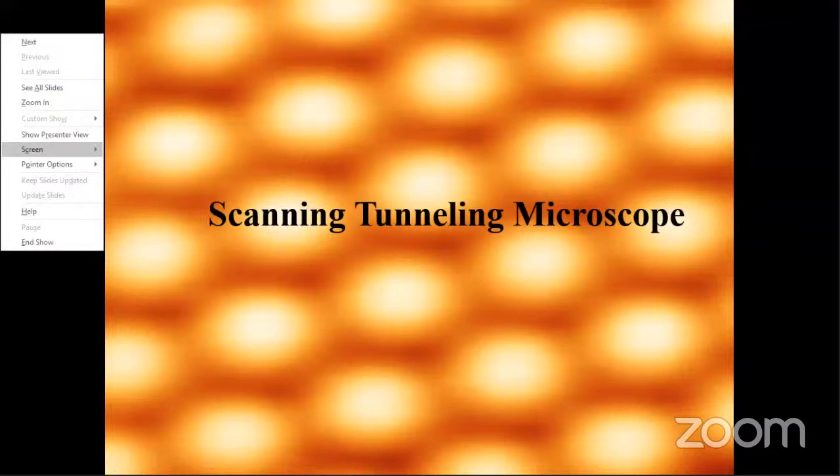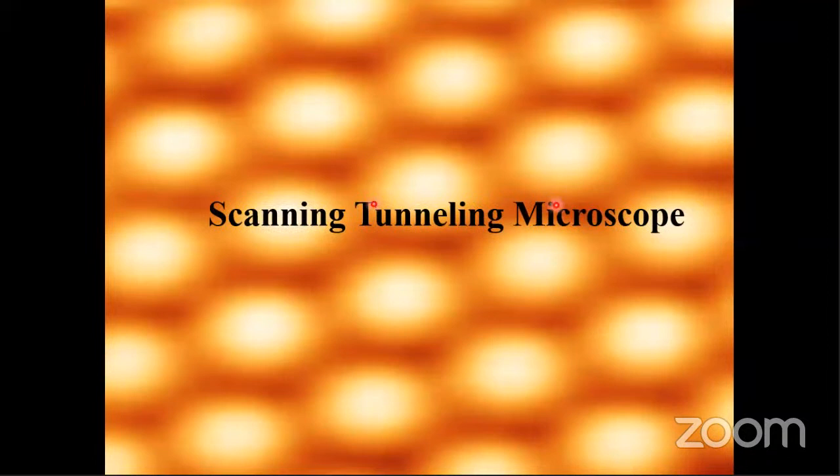So let me start once again. So scanning tunneling phenomena is occurring over there in the microscope. Okay, let's go deeper into STM.